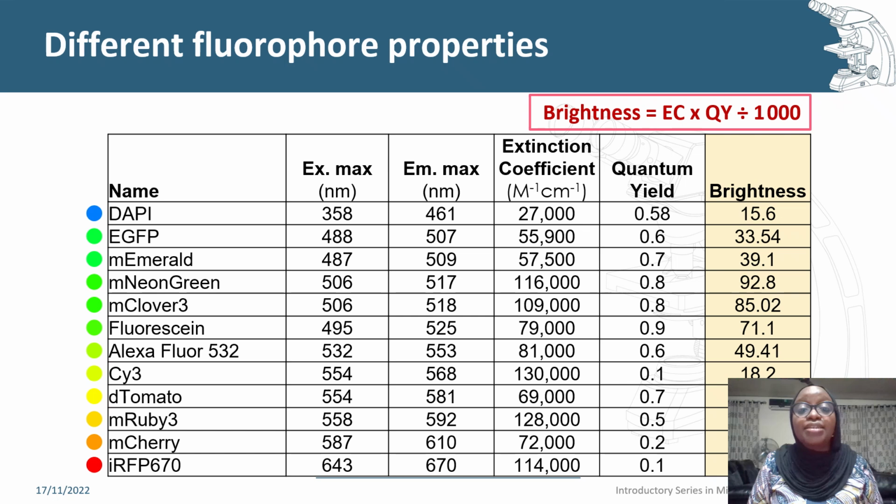The higher the extinction coefficient, the more likely the photons will absorb light.